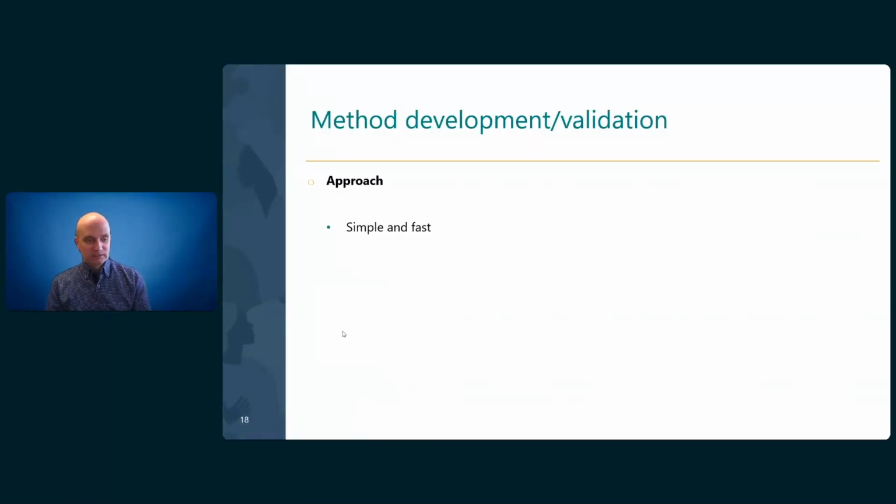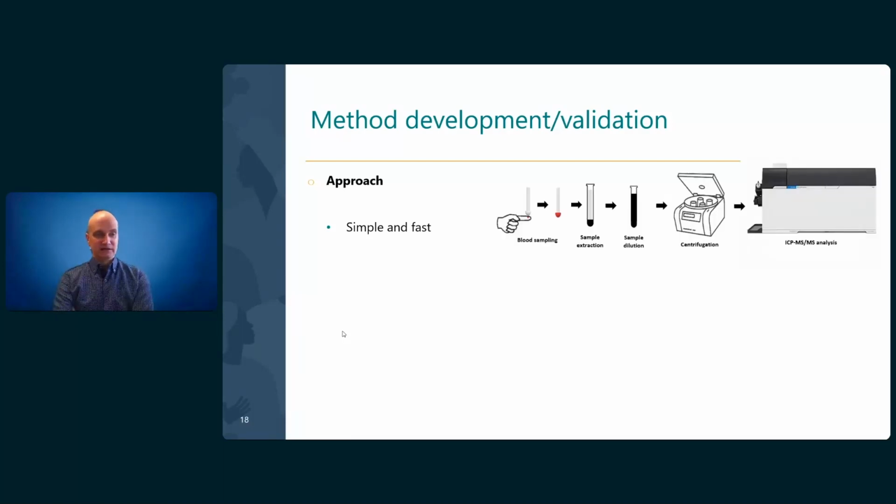Let me bring you to the method development and validation. So we thought that the approach has to be simple and easy, right? So for that reason, we just imagined that the workflow would be just collecting the sample, blood sampling, extract the analytes, dilute if necessary, and then analyze onto the ICP-MS.